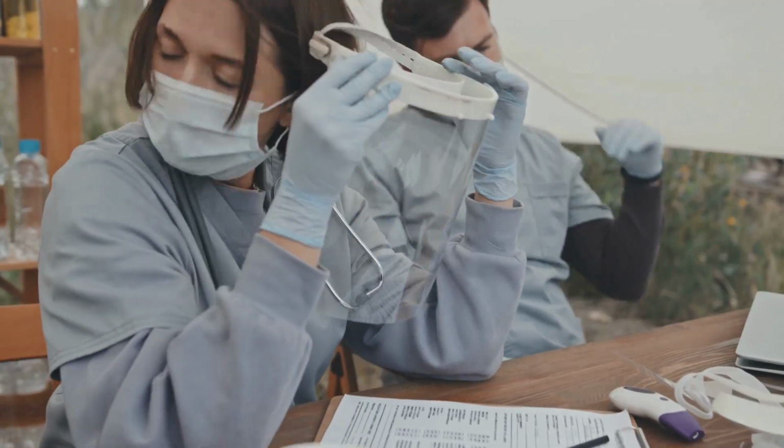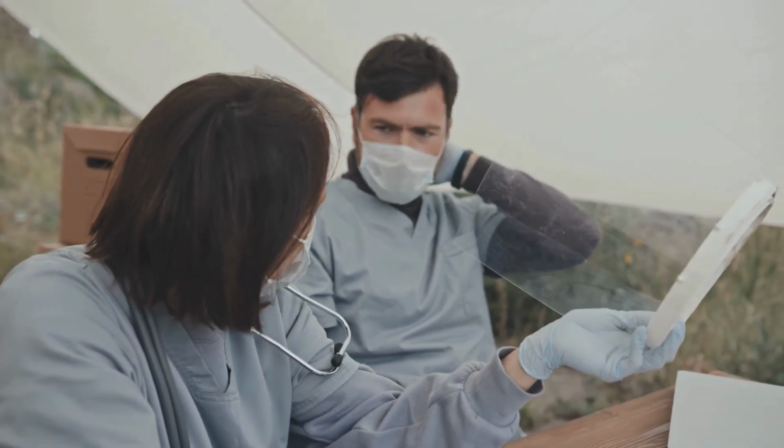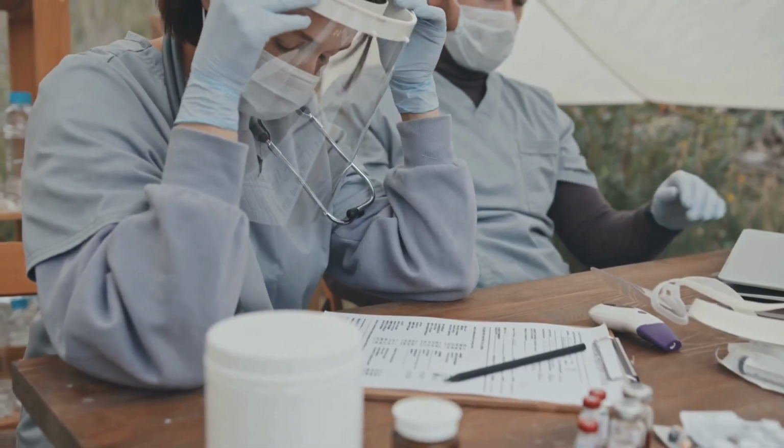Correct use of PPE involves 3 major steps: putting it on, removing it, and disposing of it properly. Mishandling PPE increases the risk of contamination, so these procedures must be followed carefully.